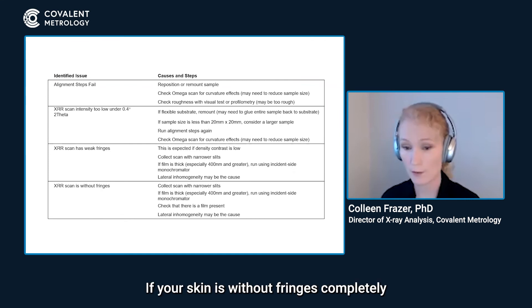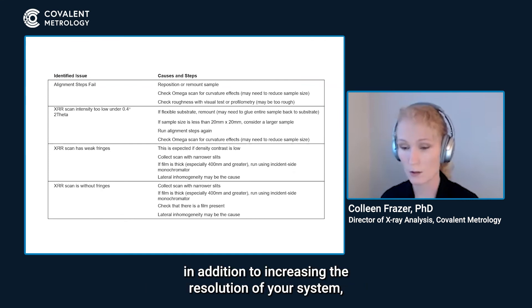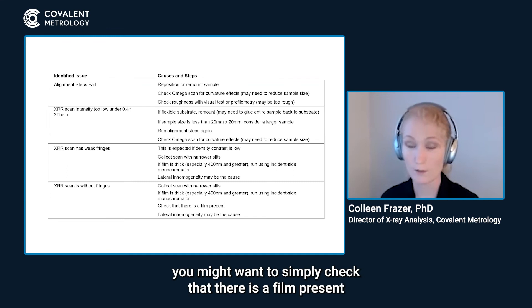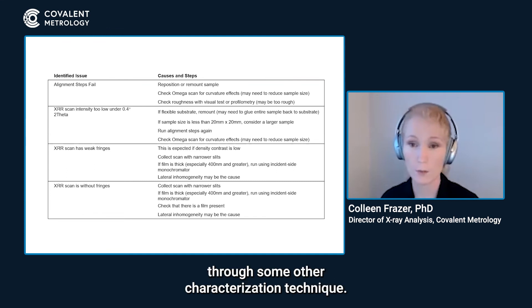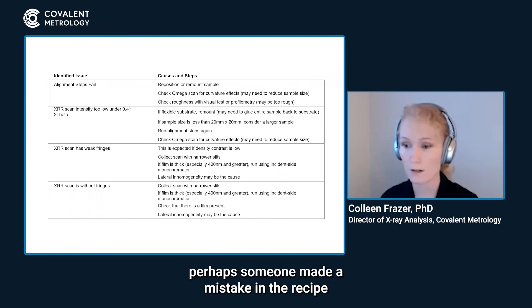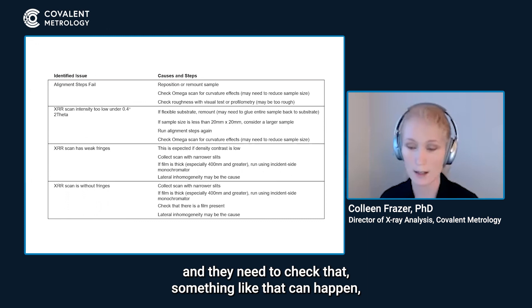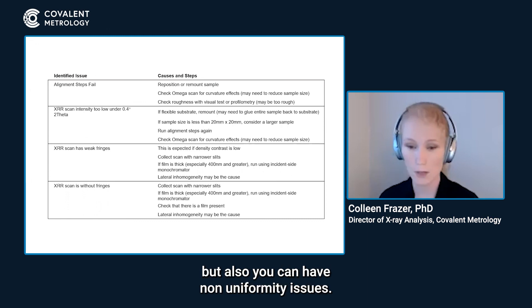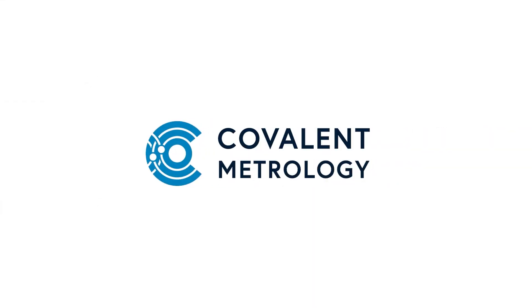If your scan is completely without fringes, in addition to increasing the resolution of your system, you might want to simply check that there is a film present through some other characterization technique. Perhaps it's on the other side, or perhaps someone made a mistake in their recipe and they need to check that. You can also have non-uniformity issues.